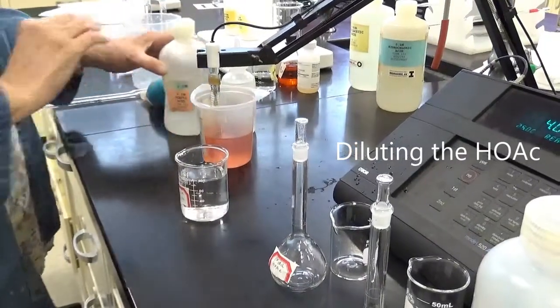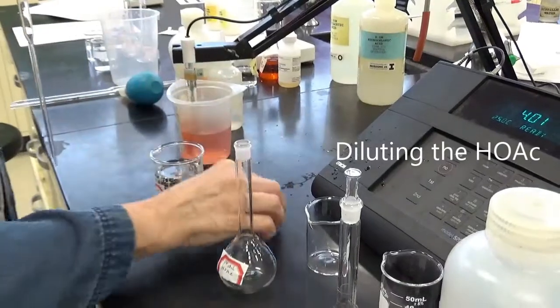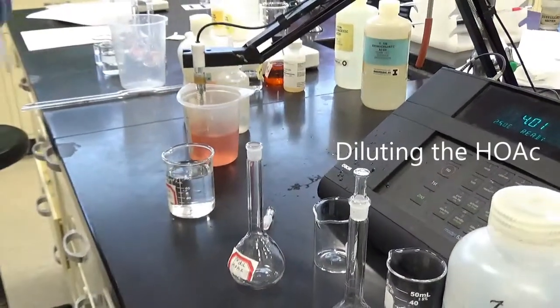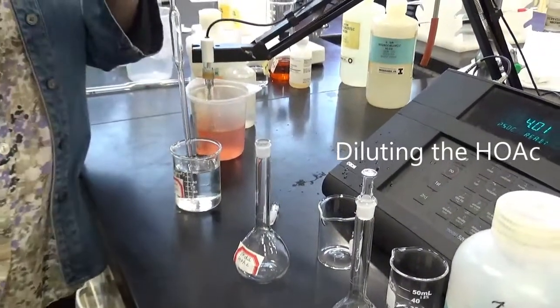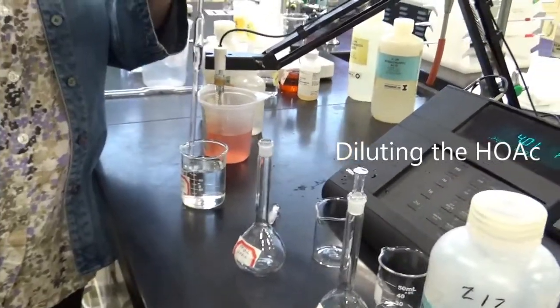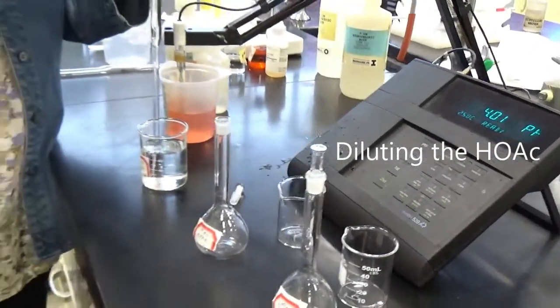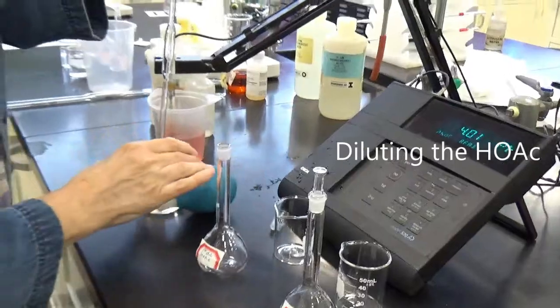I'm going to use a 5 milliliter pipette to pipette 5 milliliters, put it in a 50 milliliter volumetric flask. That's what this is, with a long neck. Those are flasks we use for dilution, because we can get the volume pretty precisely with that long skinny neck.